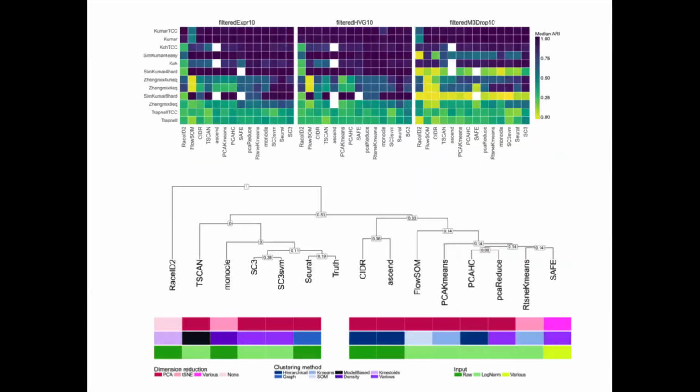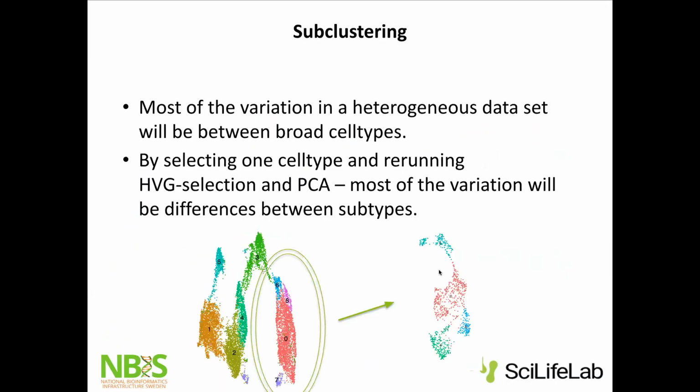Let's see, we can take just this plot as an example, because of course, is it true that these are distinct clusters, or should all of this be one single cluster? Those kinds of decisions are something you will always have to face.